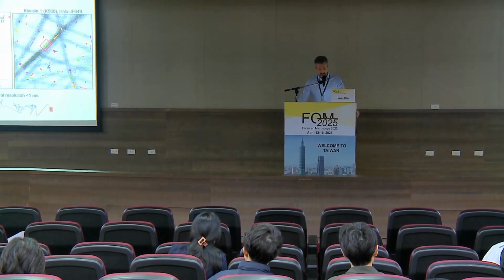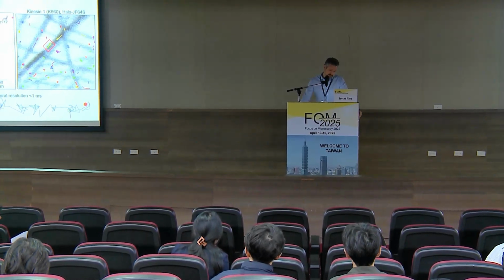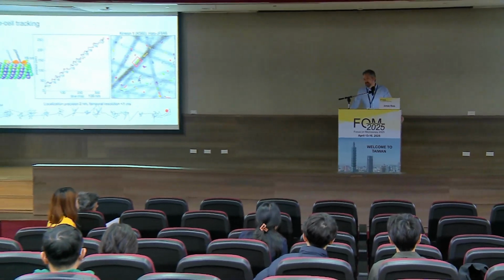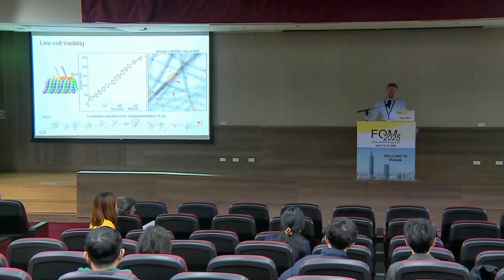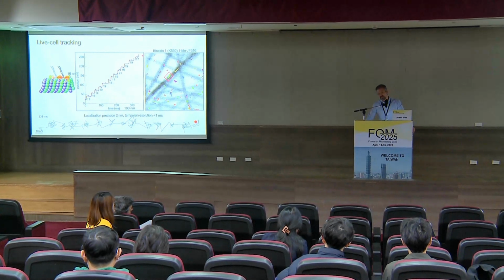Okay, so you understand such fluctuation is more likely to come from the measurement, but not from biology. Or it could be biology, and that's what many people are trying to do with MINFLUX. And I would always try to exclude that it comes from the measurement before interpreting biology.